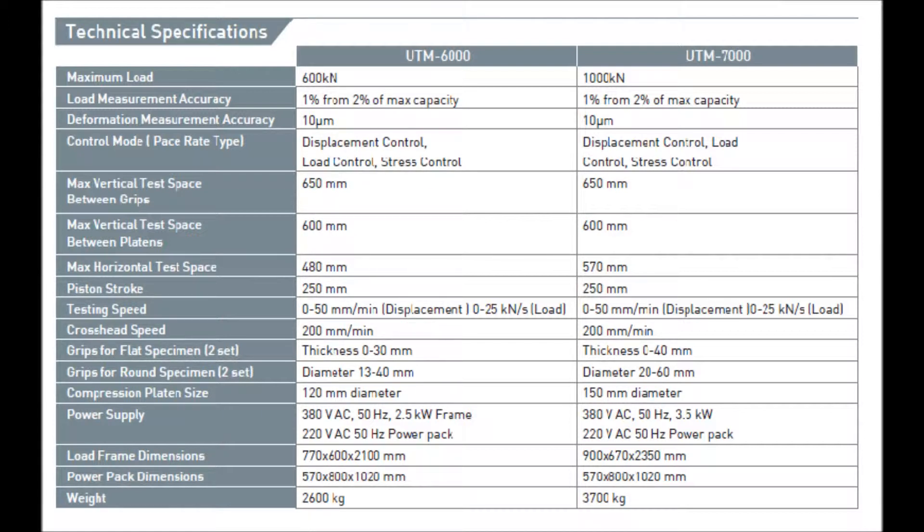Cross Head Speed – 200mm per minute. Grips for Flat Specimen to suit thickness 0–30mm and thickness 0–40mm. Grips for Round Specimen to suit diameter 13–40mm and diameter 20–60mm. Compression Platen Size – 120mm diameter and 150mm diameter. Power Supply – 380V AC, 50Hz.